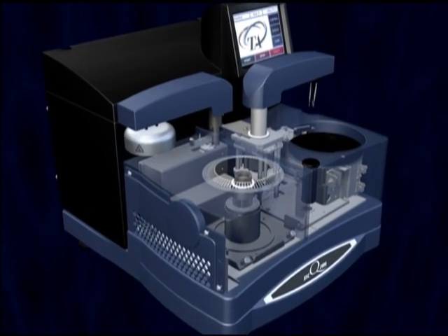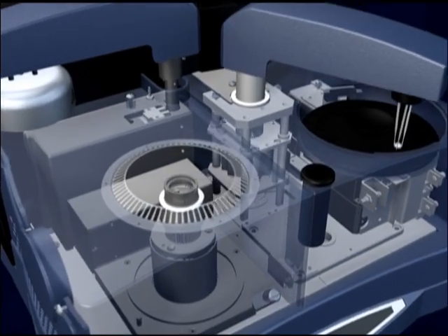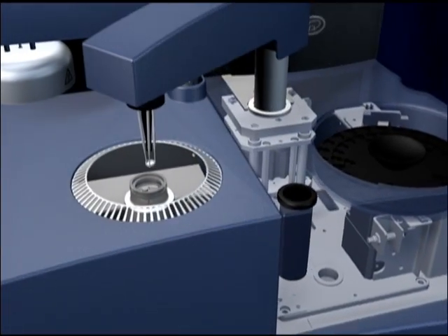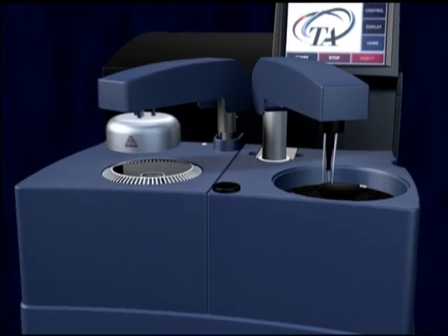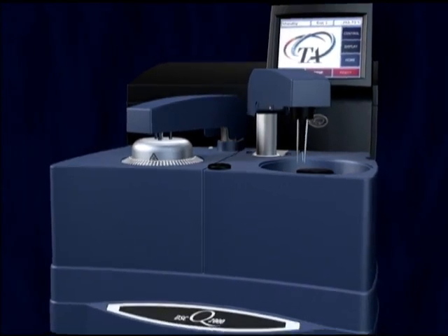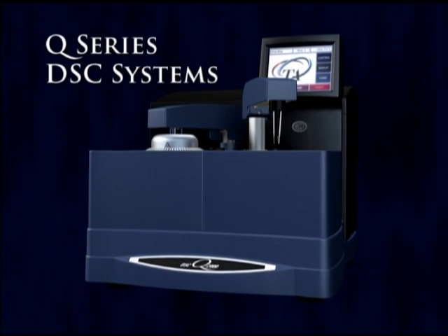When you combine the breakthrough features and over 50 design improvements — from the precise T-Zero sensor to the reliable Auto Sampler design and new Auto Lid features — what you get is a higher level of DSC technology. The new Q-Series DSC systems from TA Instruments.